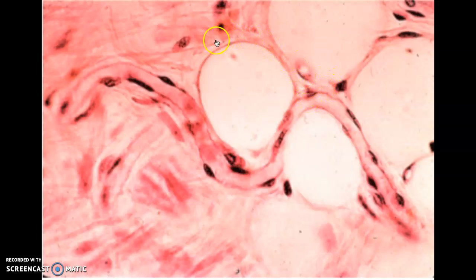Finally, you can see here a single-layer blood vessel. This single layer is a capillary. Capillaries are the smallest blood vessels. Their walls consist of a single layer of endothelial cells, and their function is interchanging gases, oxygen and CO2. These endothelial cells are wrapped around to join to themselves.